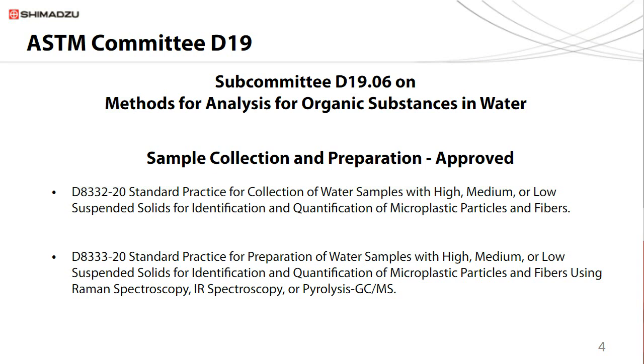There is also the Texas bill to minimize the amount of nurdles that are being released into the environment. So environmental stakeholders need standard methods that they can use in response to this regulation, but also, what is very important, to compare results from different places, different locations.